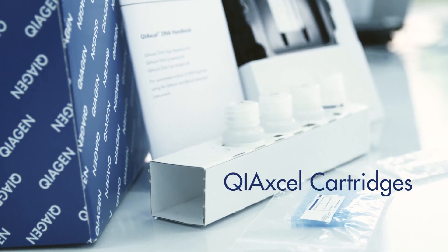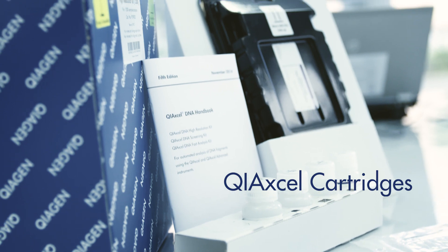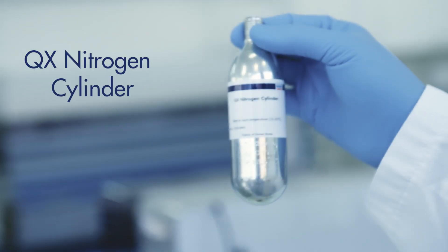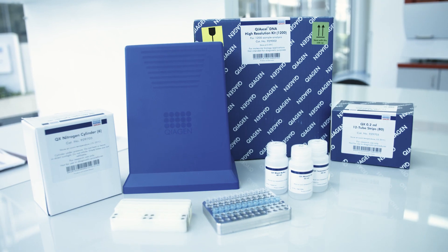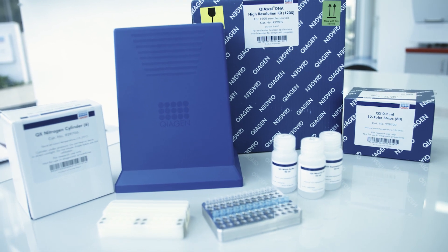To run QIAxcel Advanced, you will need QIAxcel cartridges specific for your applications and the QX nitrogen cylinder. You can analyze between 12 and 96 samples per run.